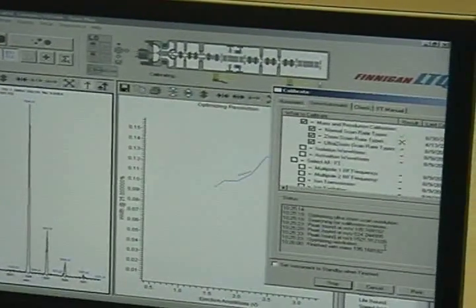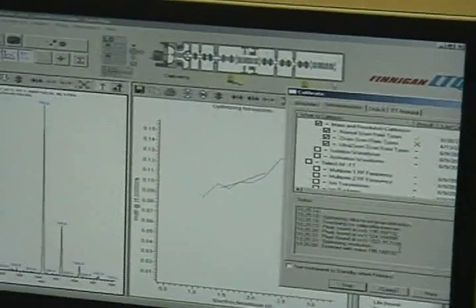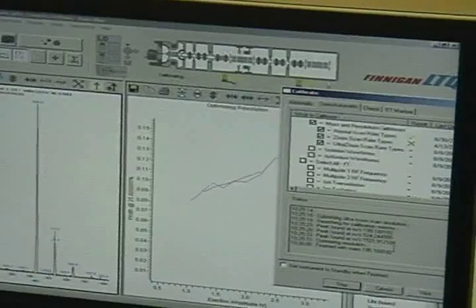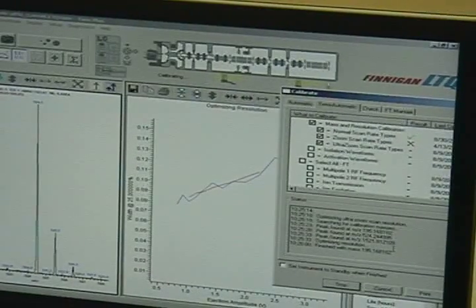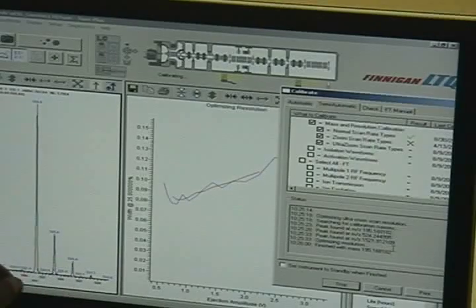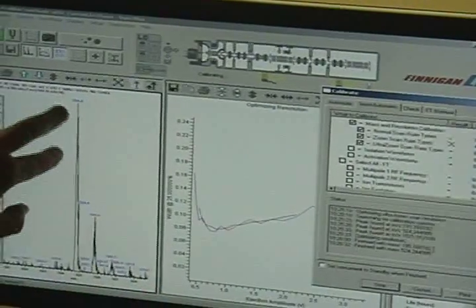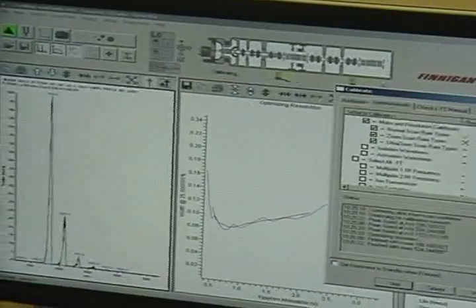The key is, with the ion trap, we can get as much resolution as we want. We can get 1,000,000 resolution. We still never get the mass accuracy, is our problem. Our ultra zoom scans are thinner than hell, but they're still not at the right position. You'll notice he's off by almost 0.3, 0.4 m over z.